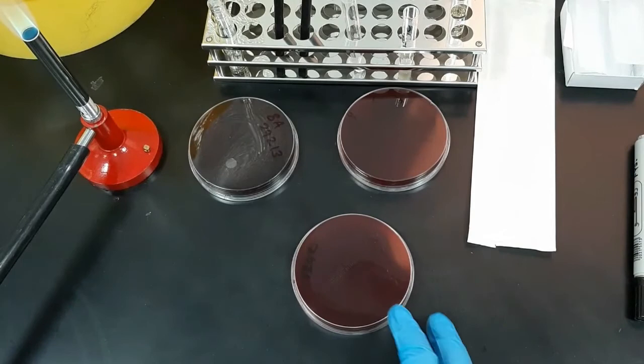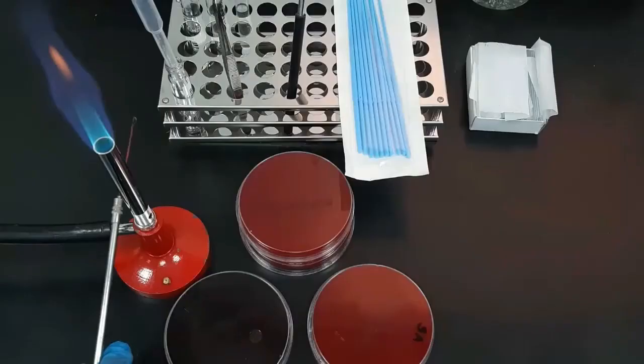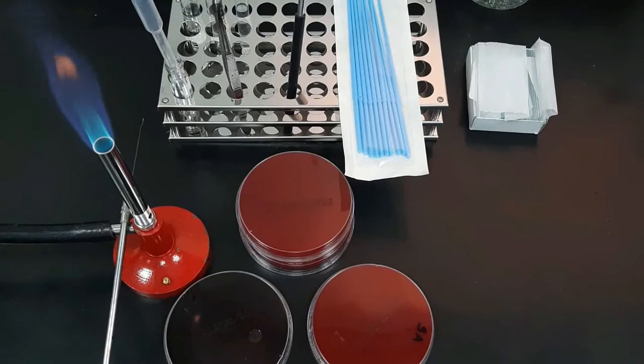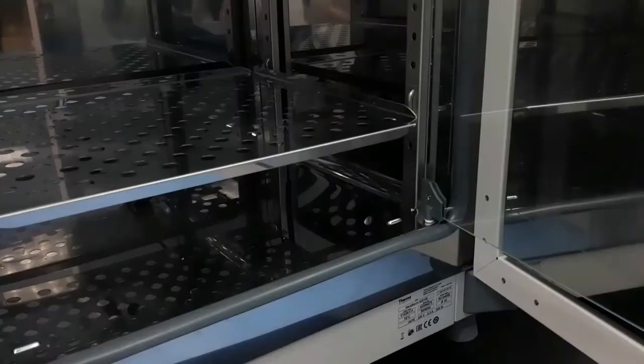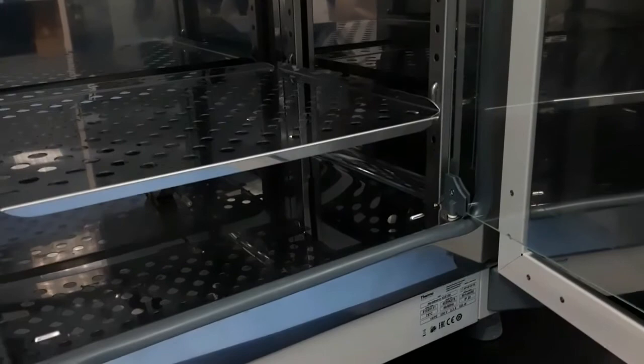Since there is thinning of inoculum during streaking, isolated colonies are formed at an ideal streak point. Discard the loop and incubate the plate in the incubator at 37 degrees Celsius overnight in an inverted position.